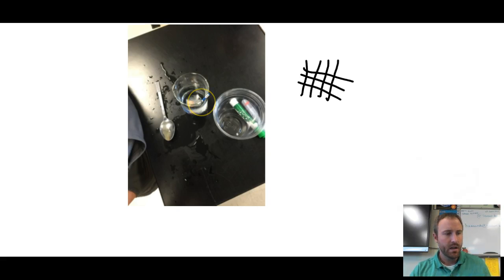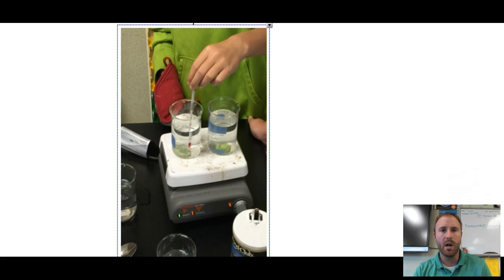All right, the next thing you needed to do then was we wanted to get into the main part of the lab. We wanted to look and see what actually happens. By adding salt, does it increase the boiling point? Does not adding the salt increase the boiling point? Which has a higher boiling point? And so the way we set this up was we took a beaker and we filled it up with water, and we put it onto our hot plate. So this was our hot plate that we put, and most of you set the amount to 10. And so on the hot plate it went.